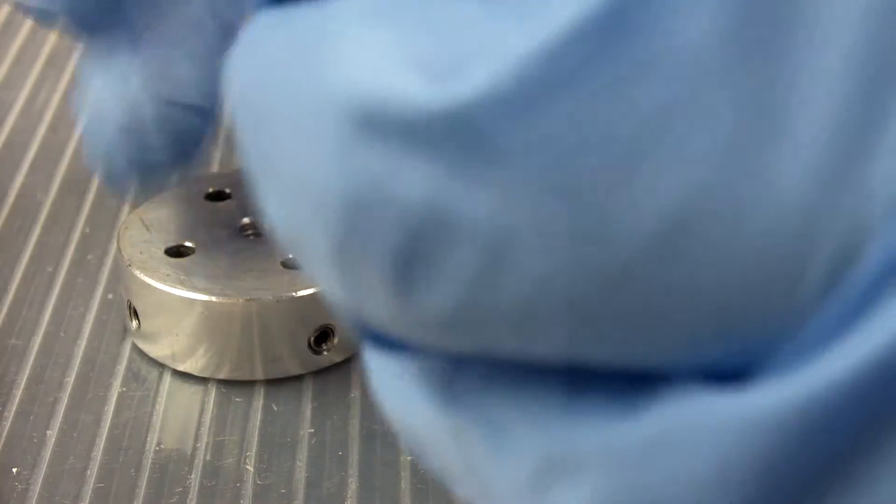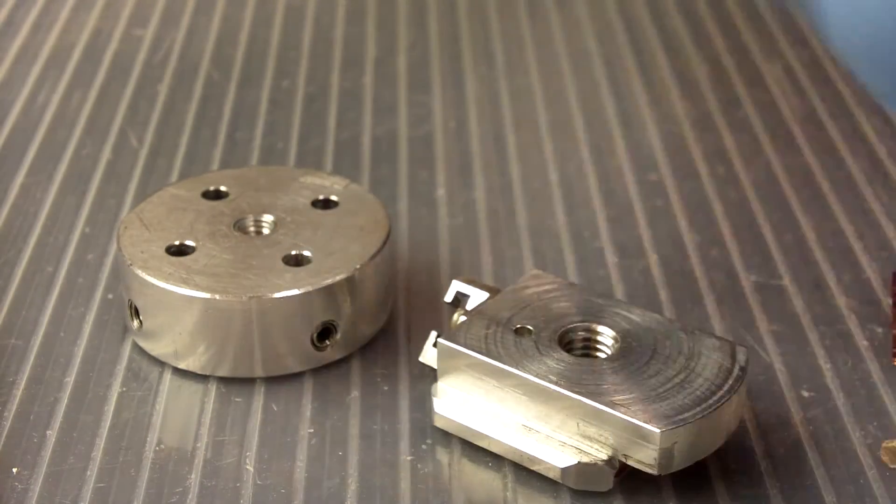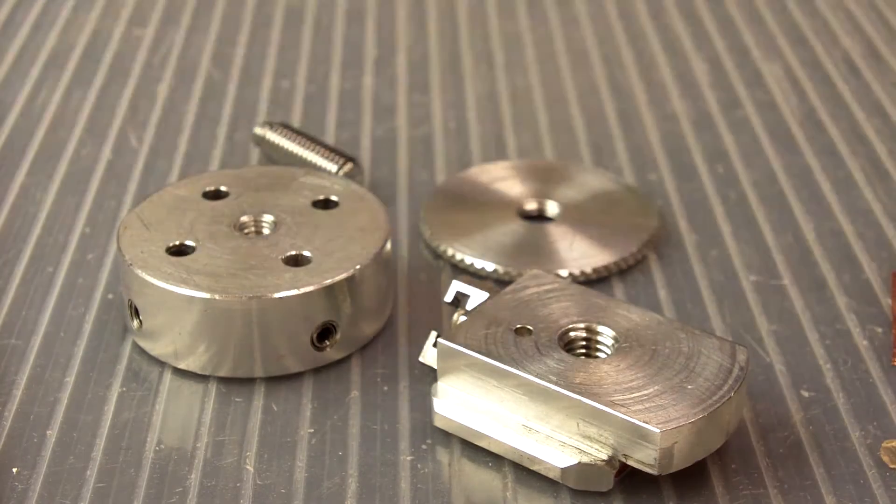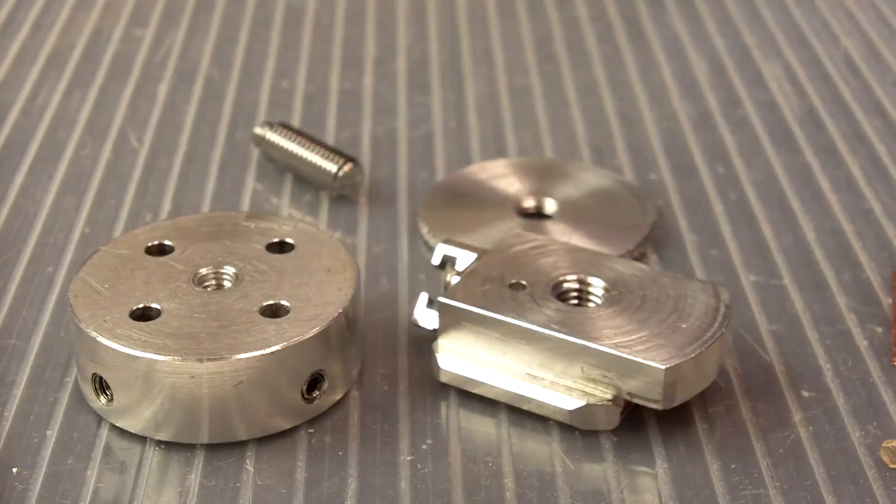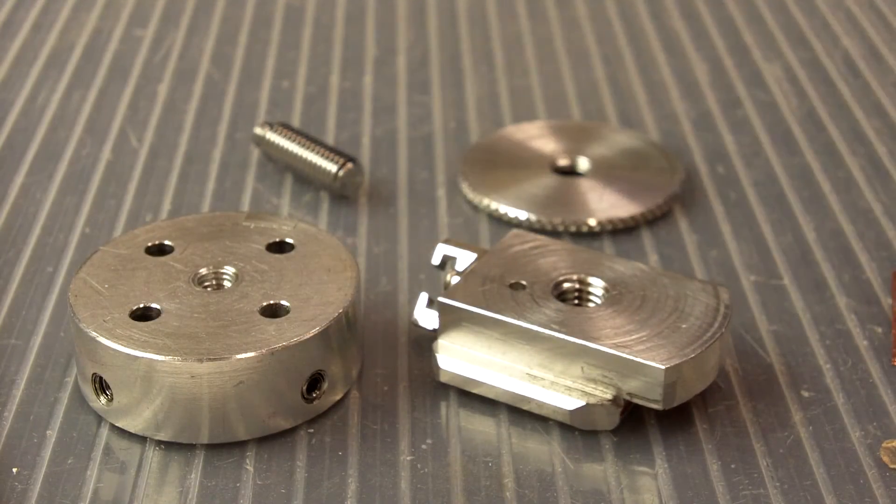And now if I want to disassemble the sample holder, we should be able to see that it comes apart again very easily. No problem whatsoever. It should go together very easily and it should come apart again very easily.